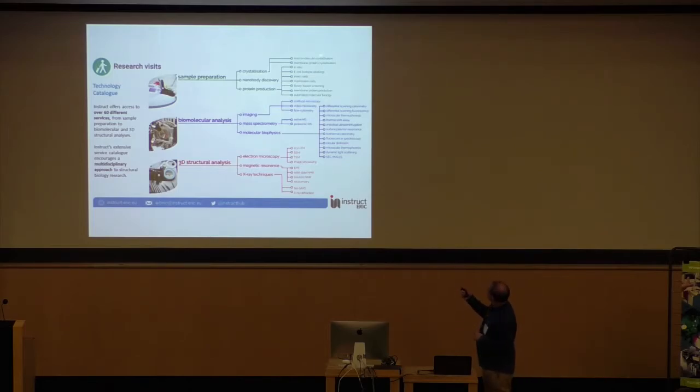This is the typical part of sample preparation, which you can find across all the centers and it's available to the community. Then you have all the characterization and imaging associated, so analysis in the molecular sense, imaging with various microscope types, confocal microscopy, super-resolution microscopy, depending on the sites, mass spectrometry in some of the sites, molecular biophysics. So this is all the characterization methods which are available to the entire community. And then the structural analysis, where you have electron microscopy, NMR, and X-ray crystallography as the main driving forces.